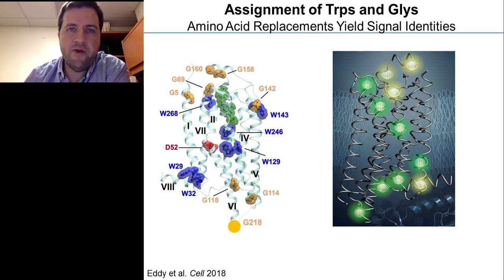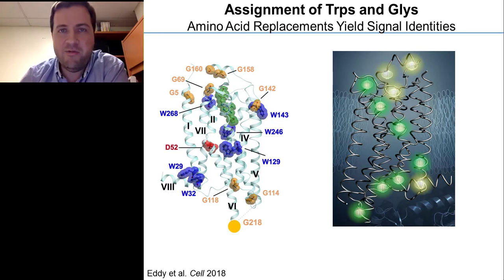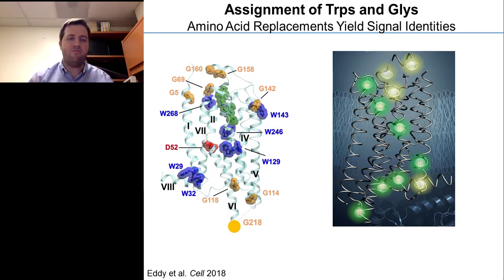As you remember from the title slide, there was a picture of the receptor with lanterns hung in key positions. This was the motivation for that picture, suggesting that each one of these lanterns is an NMR probe lighting up local structural regions of the receptor, and altogether providing a comprehensive view of the protein.